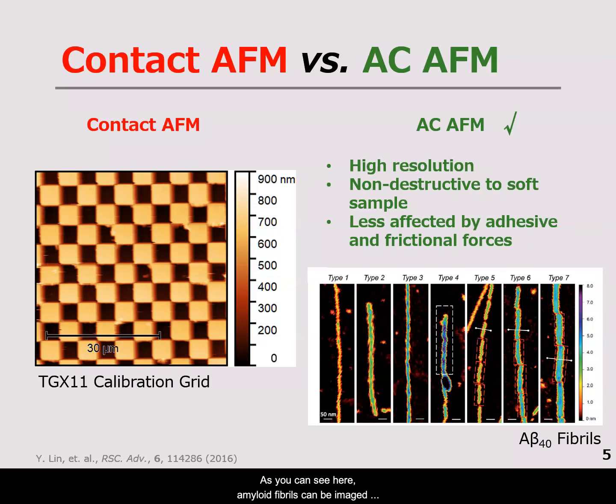As you can see here, amyloid fibrils can be imaged with AC AFM, and we can even distinguish the type of them. In Fakhraai Lab, you can work with contact AFM, acoustic-driven, and magnetic-driven AC AFM. You can also image in water.